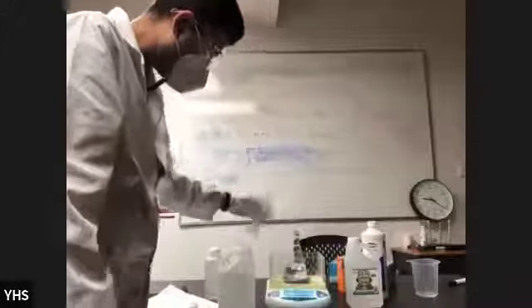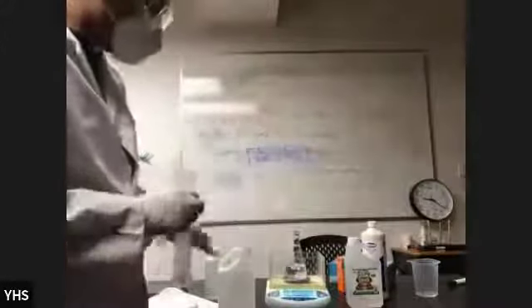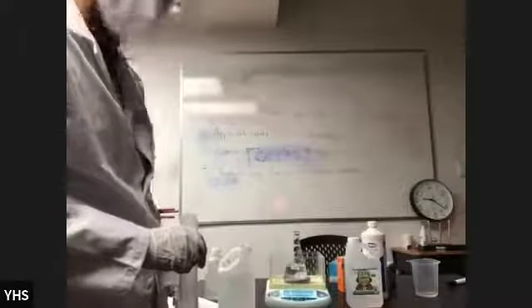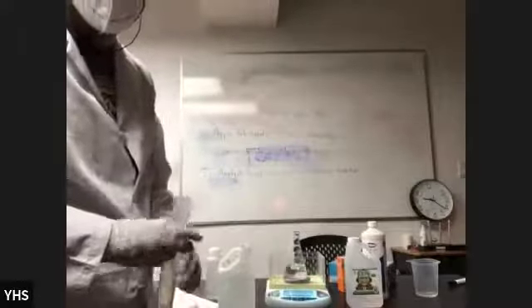Okay. So right now, the mass that the scale is showing me is 259 grams. So the first one right here, that is the mass of the cup plus the solvent, is 259 grams.